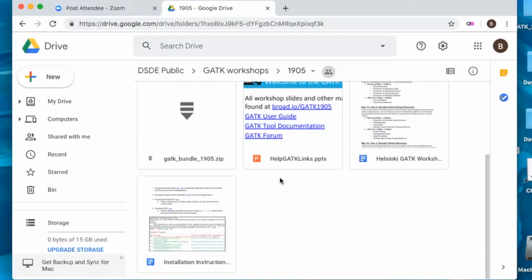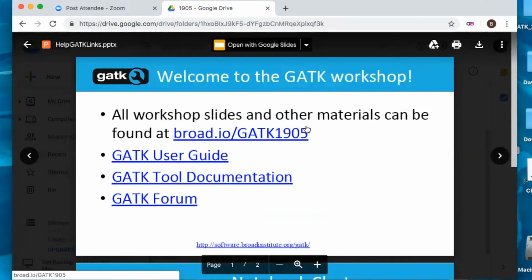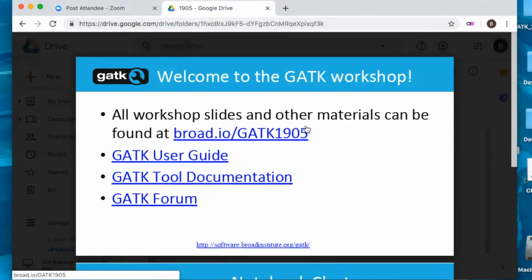If you scroll down, I've created this slide to give you some important links. We spoke a lot about GATK tools and how to use them, but in the workshop, you can only cover so many different use cases for a particular tool. If you would like to learn more about the tools and all the options, we also provide a lot of tutorials and blogs.